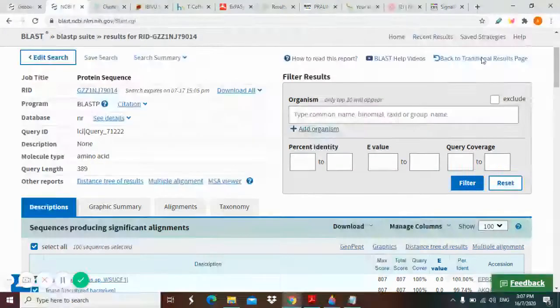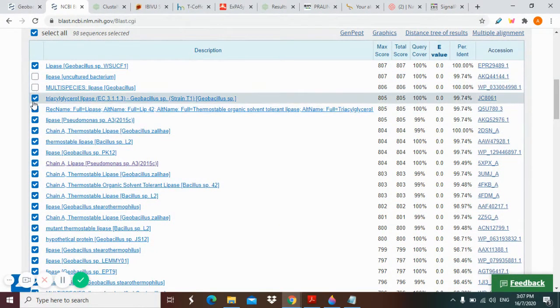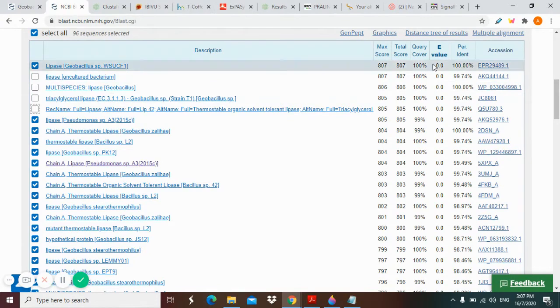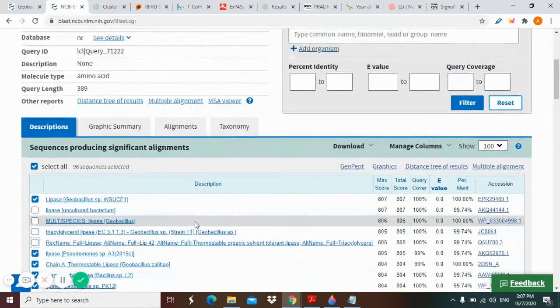Okay, so you need to select the gene manually. What I look at when I want to select the gene is that I'll make sure that I won't select the sequence with the same percentage identity, since we want a varied identity. Okay, actually I've already selected the gene.